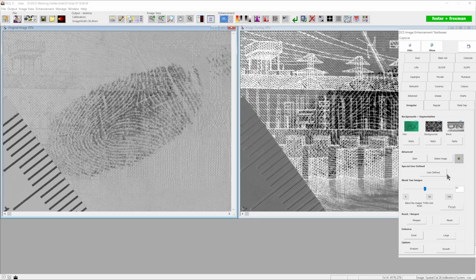So it's probably going to be about here in this image. But actually what you can see is we don't see any black, any white in the background. You might still see the physical etching that's on the banknote itself, but now there's no colours in the background interacting. Now once you're happy with this, you click Finish.